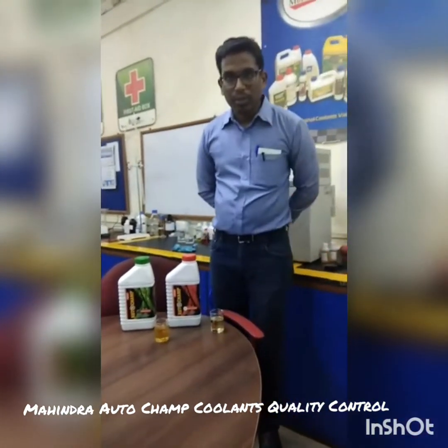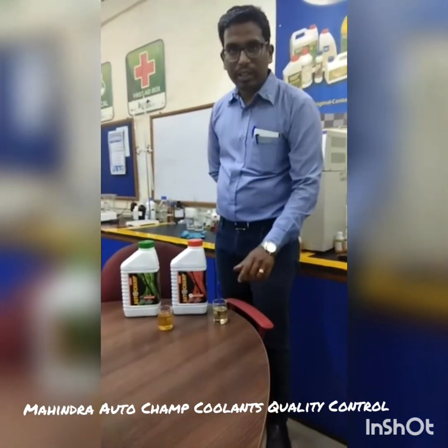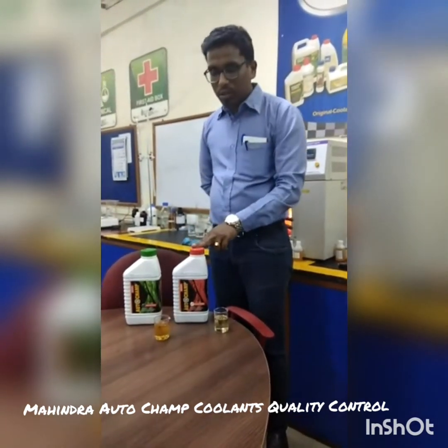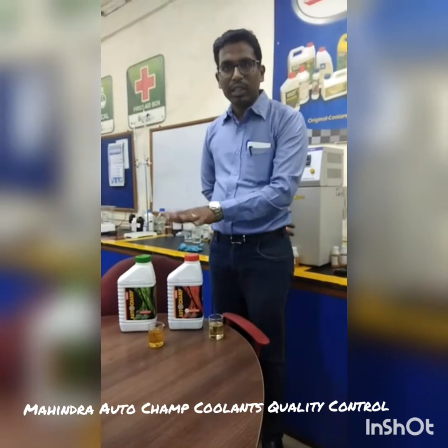Chemical composition is different for red coolant and green coolant. We are adding 2-EHA as ethylhexanoic acid for red coolant. We are using CO-40, which means it is a castor oil, and that is used for green coolant. This is the difference in chemical composition.